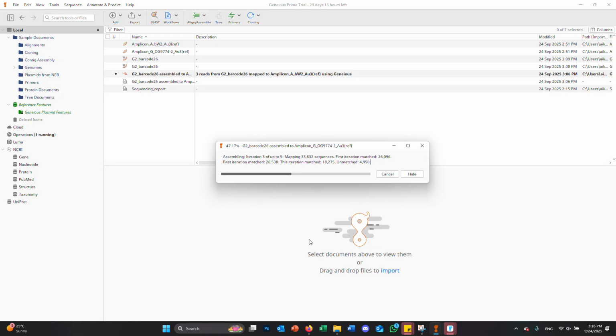My suspicion is that everyone in this room should have a high match to the Australian isolates, so things that have AU3 next to it. I did have a quick look at some of these amplicons, and all the ones I checked were matching to Australia.